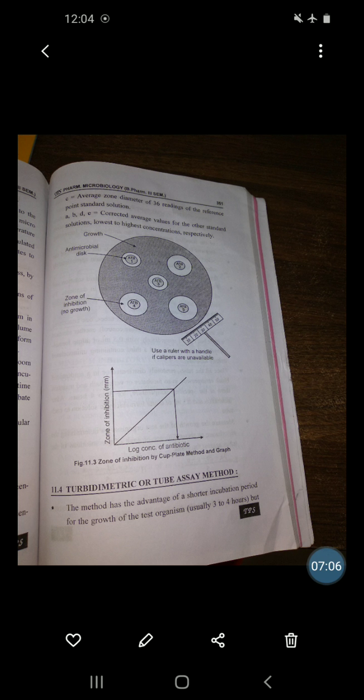Plot the graph for what? That is the log concentration of antibiotic versus zone of inhibition in mm. So this is the cylinder plate method or the cup plate method. Next, that is the turbidimetric method or the tube assay method.